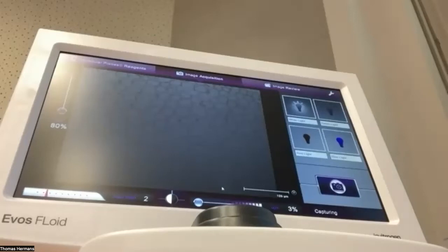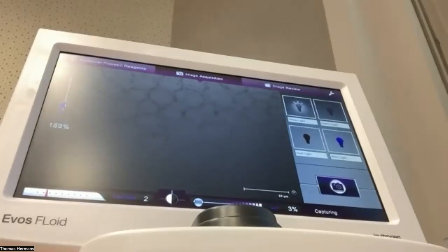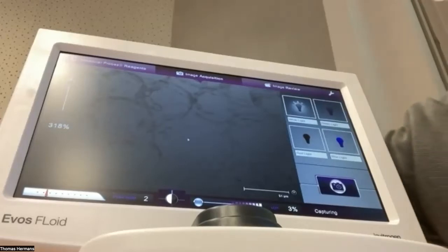So what you can see here is a slice of a plant, and you see the cursor? Yes. And you see these round things. Those are cell walls, and these things here are actually plant structures, and then these round things are tiny little cells. We can magnify. Okay, this is digital magnification. There's a focus. Sorry, it's not ideal.